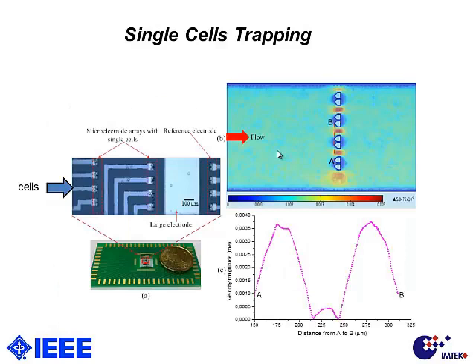So this figure is a real image of our chip, and the channel with the single cell on the electrode in the left side, and the right side, by the way we arrange the cell capture structure, is without a cell and used for reference. And we would like to know the effect of the flow rate inside the channel.